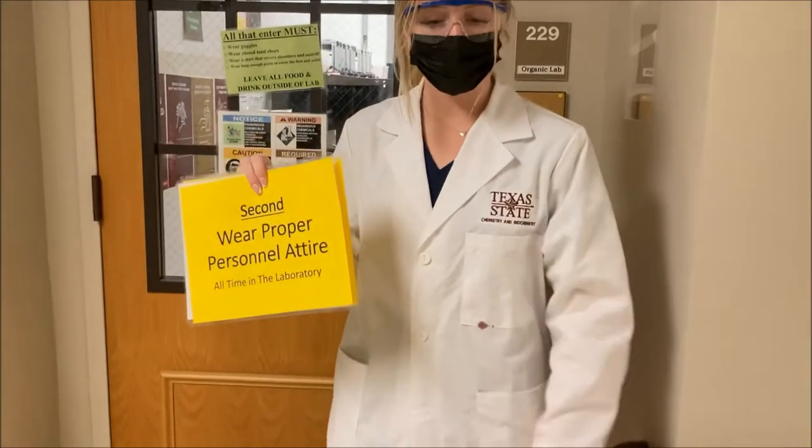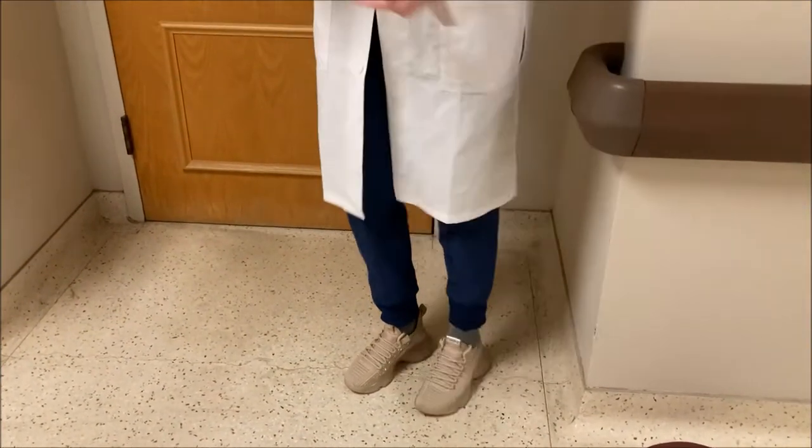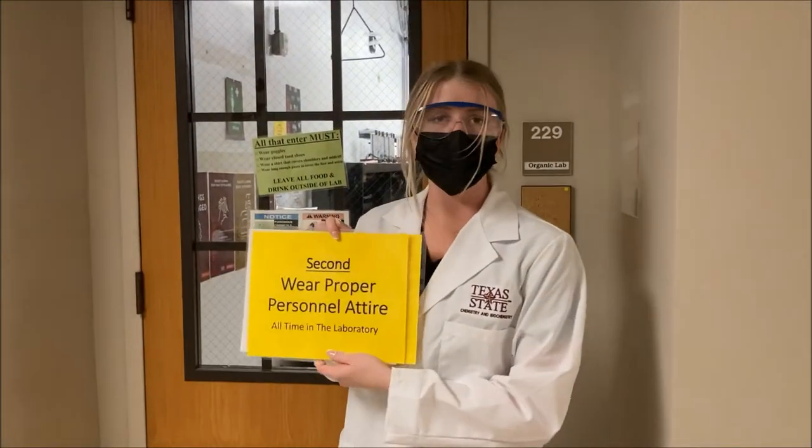Proper attire means your shoulders are covered, all your skin is covered, you have your long socks on, no ankles, no skin showing anywhere — and then you're good to go.